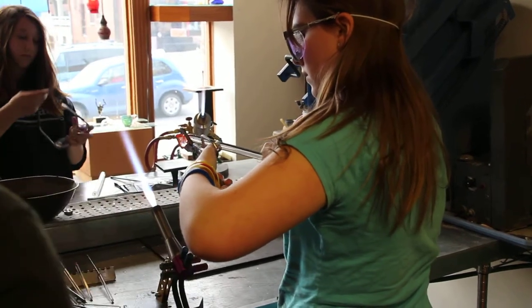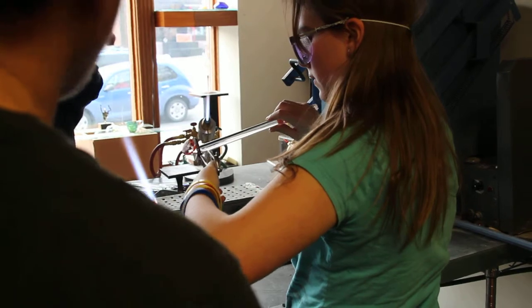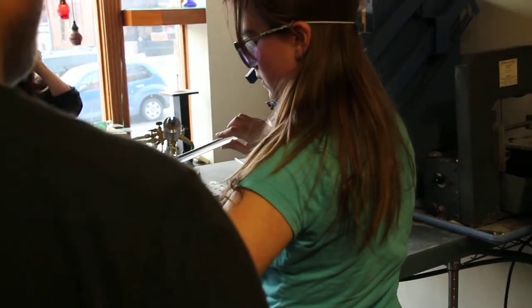You'll be able to grab it. Squeeze and rotate. Use the shears to sort of bend it in the right direction. And that's it.